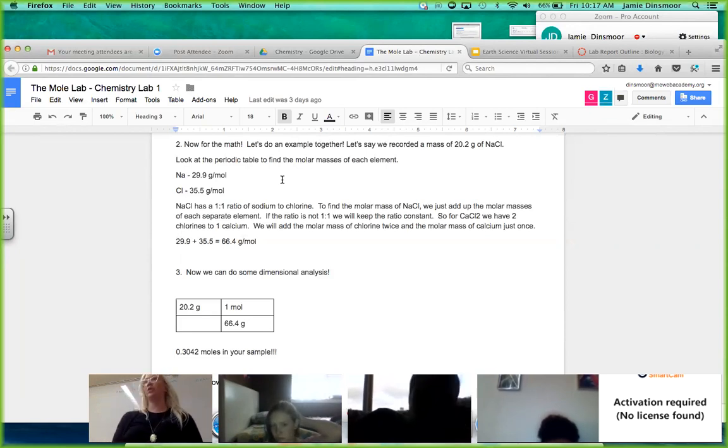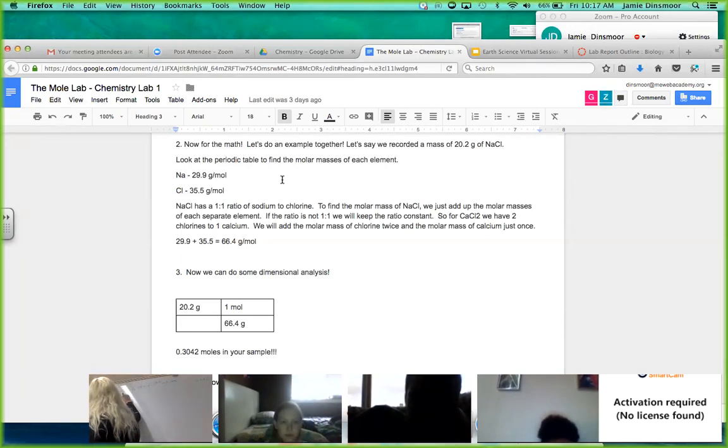We're probably going to need to know that. We also are going to need the molar mass of sodium chloride. Can one of you take a look at the periodic table and tell us what the molar mass or atomic mass, they happen to be equal, is?